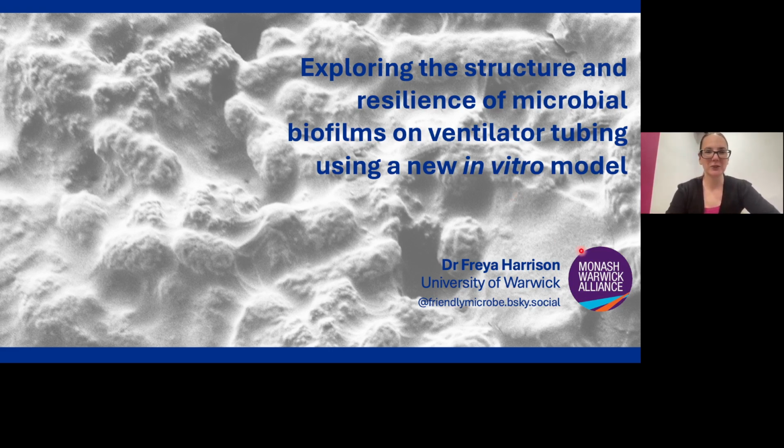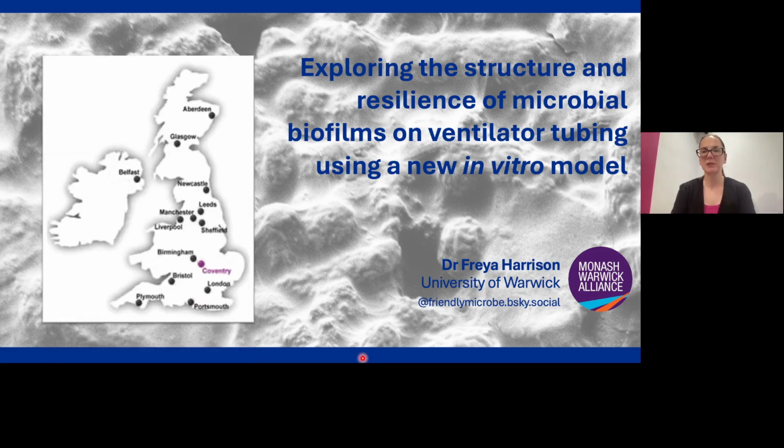I'm going to talk to you about work my lab is doing on building a new model of studying biofilms in ventilator tubing. If I can find my slide changer. Yeah, I'm speaking to you today.